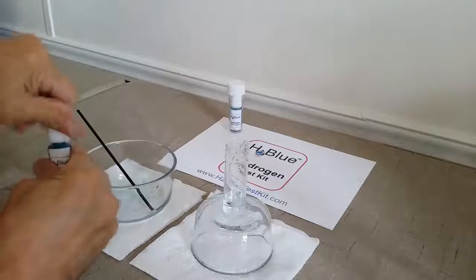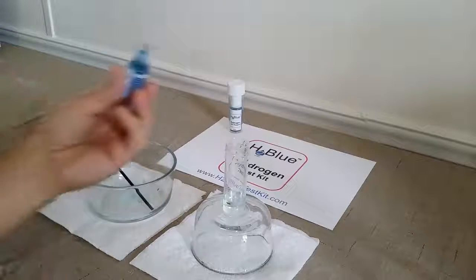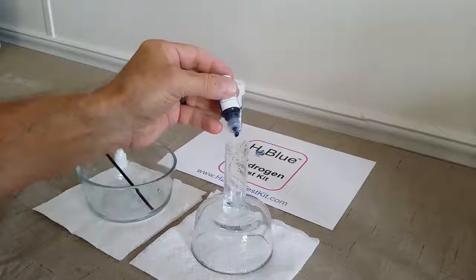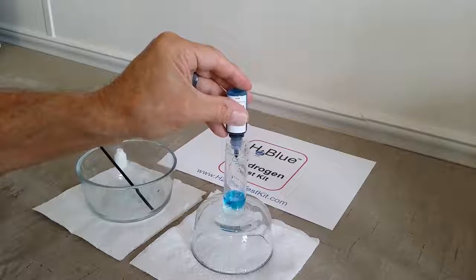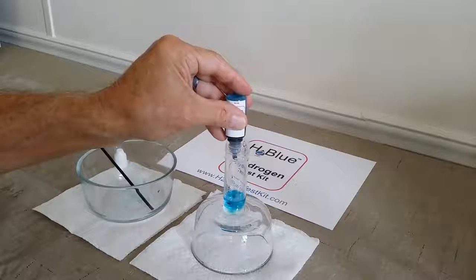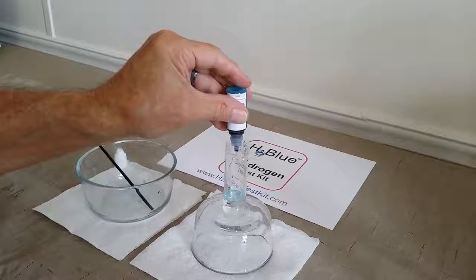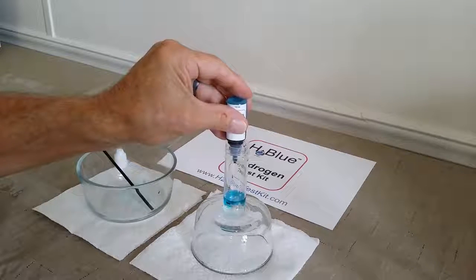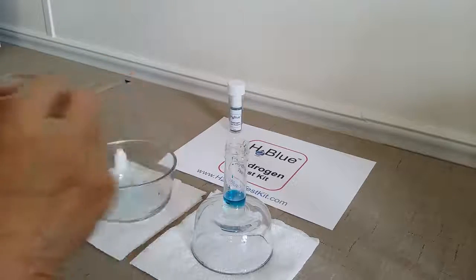And then we will start dropping drops in. Each drop, remember, represents 0.1 ppm of hydrogen. At first I can drop quite a few drops. 1, 2, 3, 4, 5, 6. You can see that they're disappearing, so I know I'm not even close yet. 7, 8, 9, 10, 11, 12. I'll stop there, and I will gently stir. You don't want to shake this beaker.